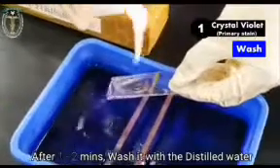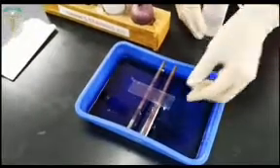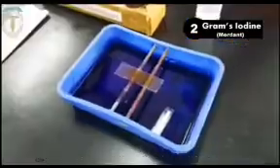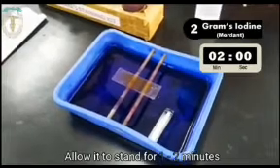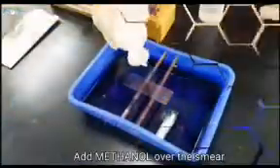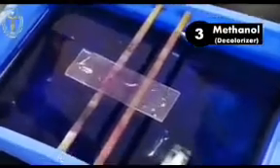Next we add Gram iodine solution to the smear, leave it for about 1 to 2 minutes, and wash off with distilled water. After that we add methanol over the smear for about 15 to 20 seconds.